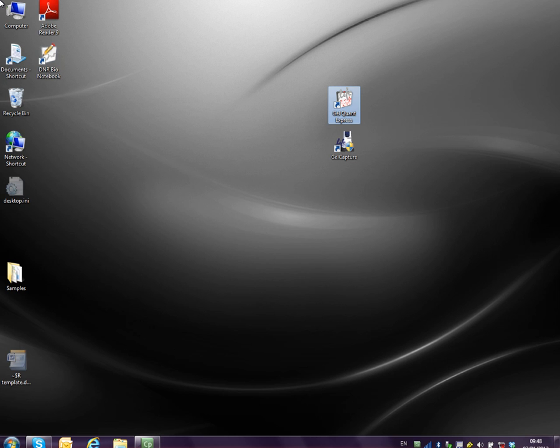Once your software is installed and the dongle is inserted into your computer's USB slot, open the GelQuant Express software by double-clicking the icon on your desktop.